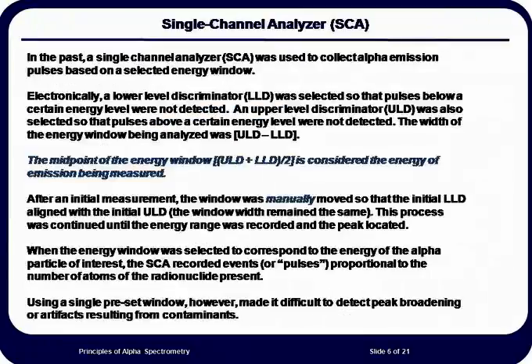Historically, the technique used to determine the alpha particle energies used an instrument that had very good resolution. However, the instrument was not very rugged, and the energy of emission of the alpha particles was measured as a function of increasing voltage across the detector.